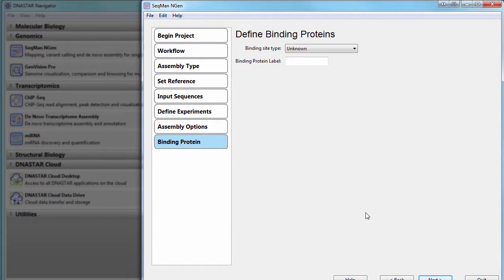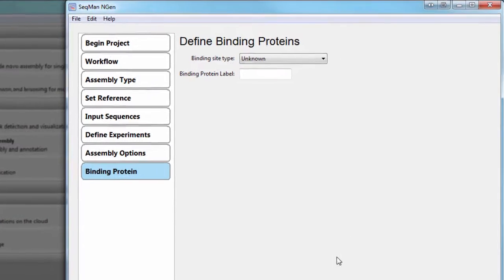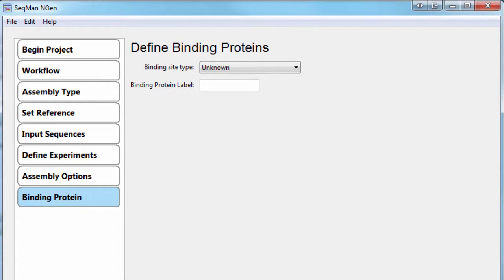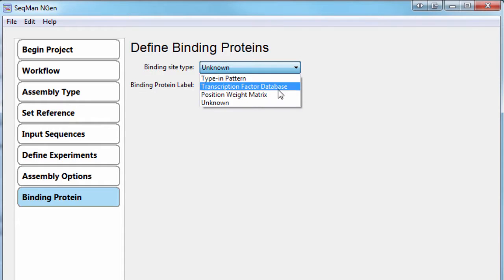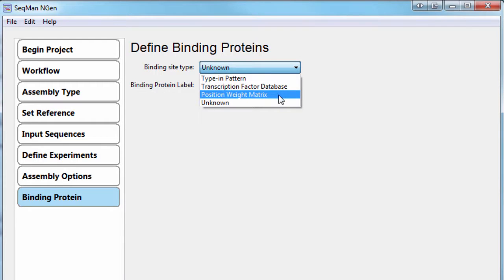Now I need to define binding proteins for the experiment. In this example, I'm going to choose Position Weight Matrix.